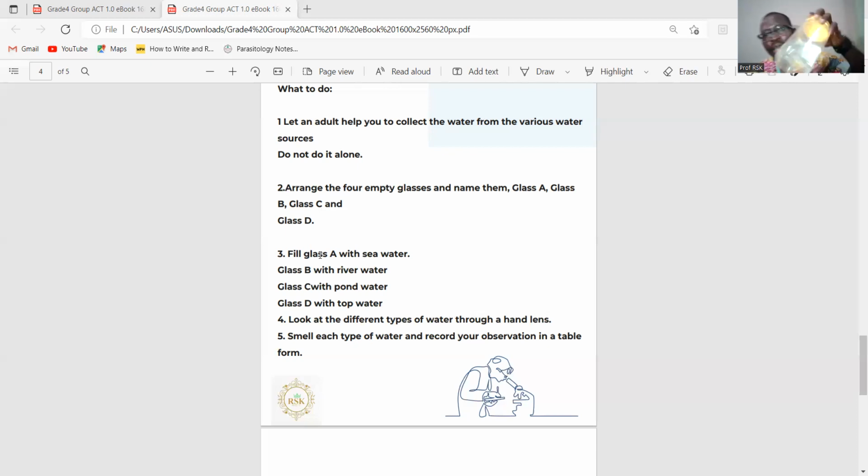We have disqualified the seawater because it has salt in it. It has taste, and good drinking water is tasteless, right? And then the river water too is no good because we see some particles running through it. You can see it from here. Just check it out. Okay, right. So we have disqualified that one too. Now let's go to our tap water.